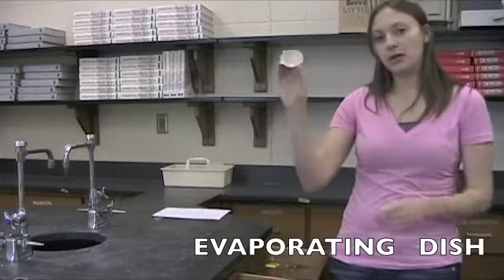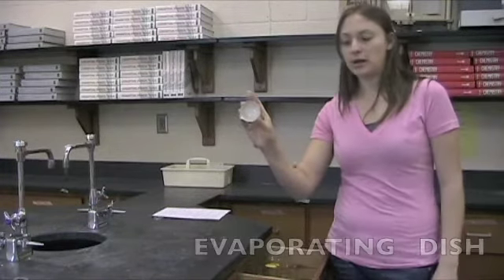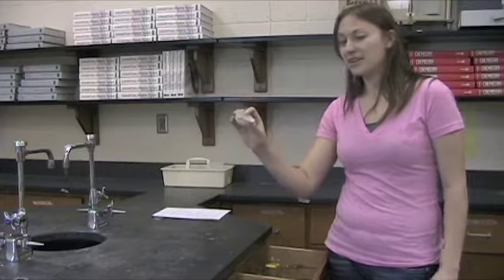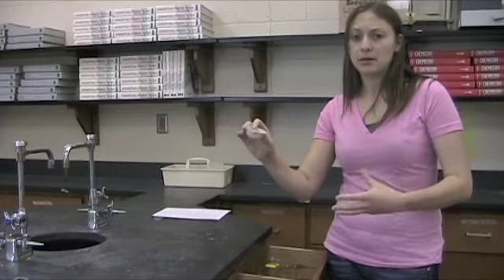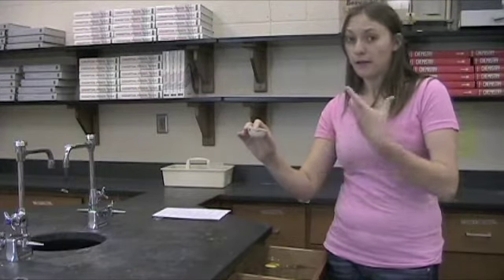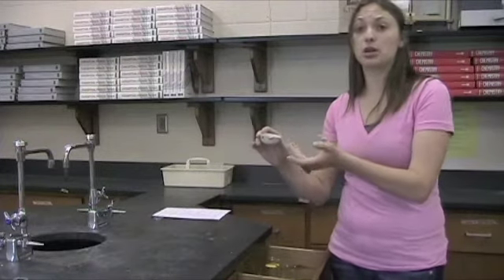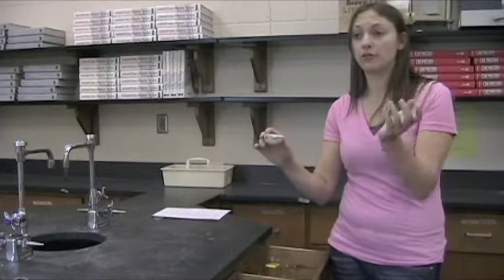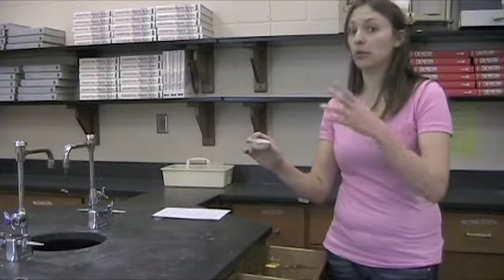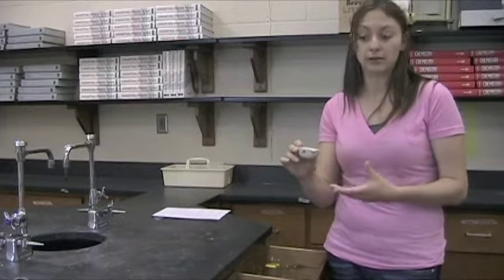Next we have an evaporating dish. Evaporating dishes are very similar to crucibles. They are ceramic. They aren't just used for what they sound like, evaporating things. So, I'll put this over a Bunsen burner. I'll have a solution and I'll try to evaporate off just the liquid and leave whatever solid I had in there.